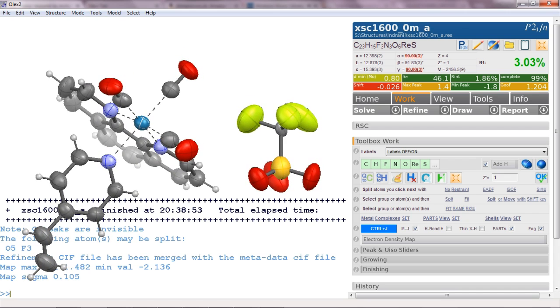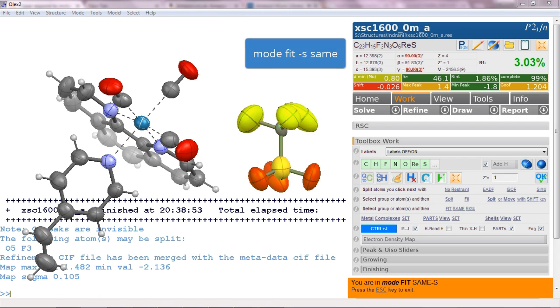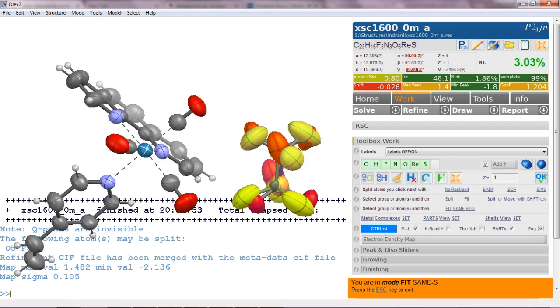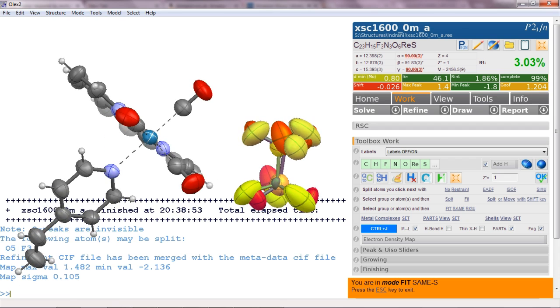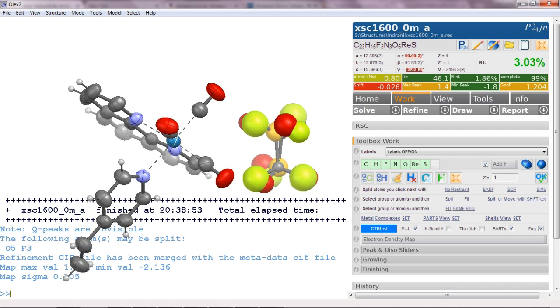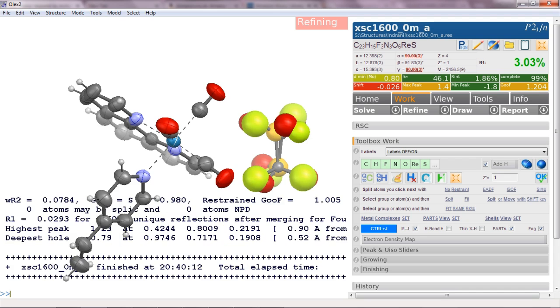So the way to deal with this in Olex 2 is you double click on the entity and the command is mode fit -s and then same. And if you put that in we can now literally grab that entity and turn it over. So we put the sulfur on the carbon and the sulfur on the carbon. Move it apart a bit so they're not actually totally on top of each other. And I think this is close enough to give it a go. So I hit escape either on the keyboard or down on the orange thing.